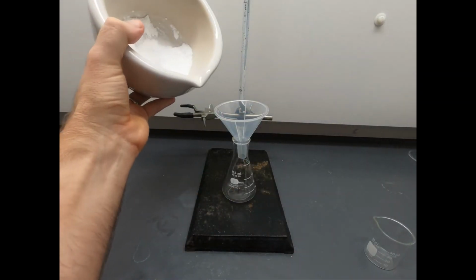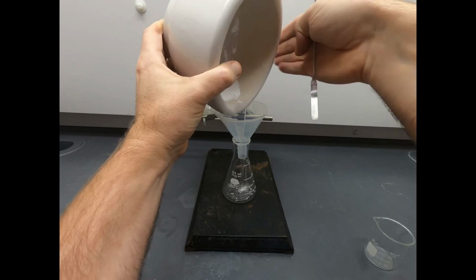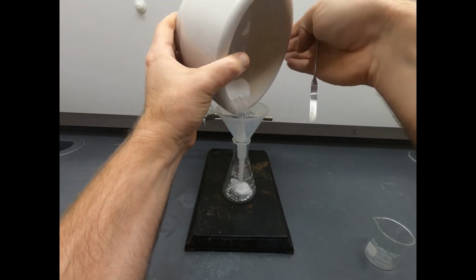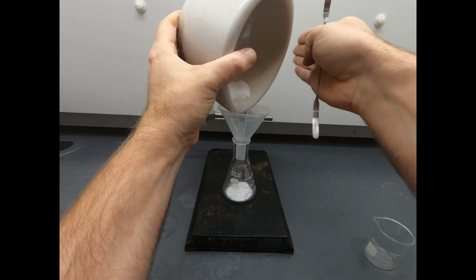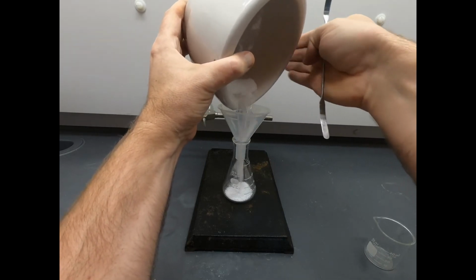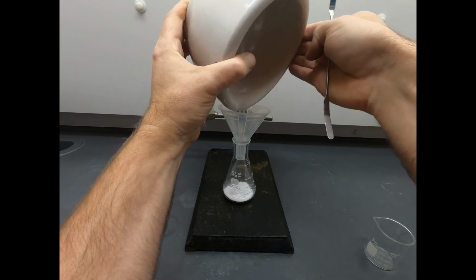So let's take our solid, and now we're going to try to get this in the funnel. It's a little bit delicate. This mortar actually is pretty heavy. I mean, it's not going to strain your back, but it's got a little heft to it. These things are made to do some work. Okay, we'll just get the best we can. That's actually pretty good. Maybe better than I expected.